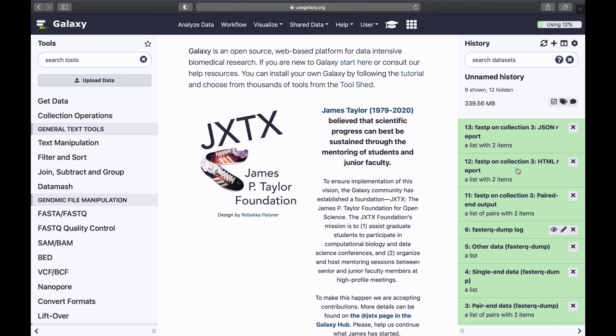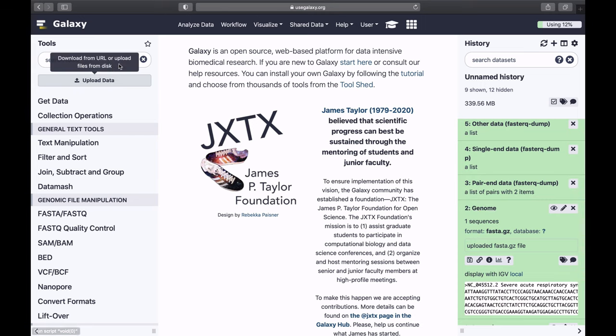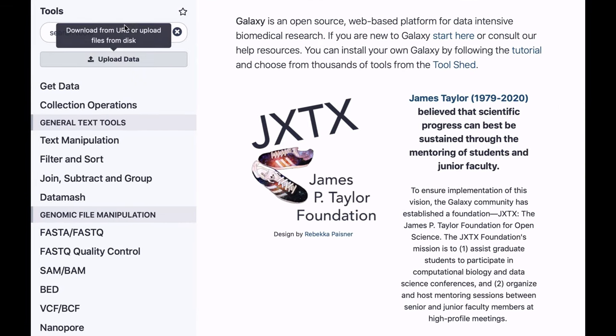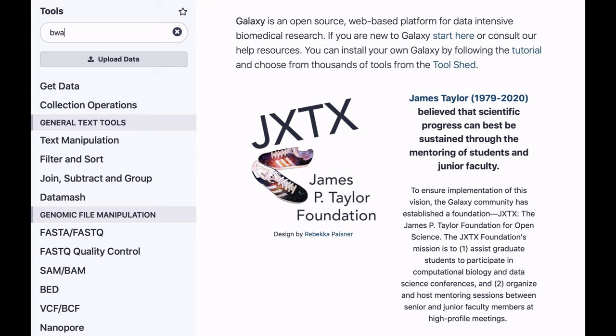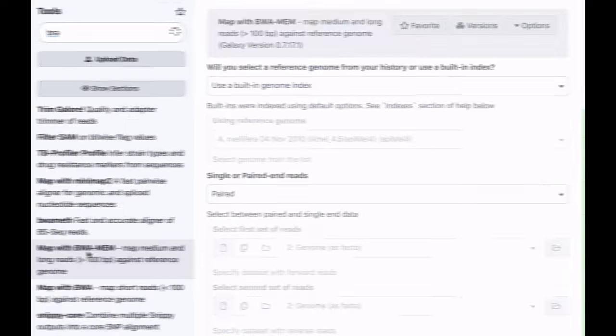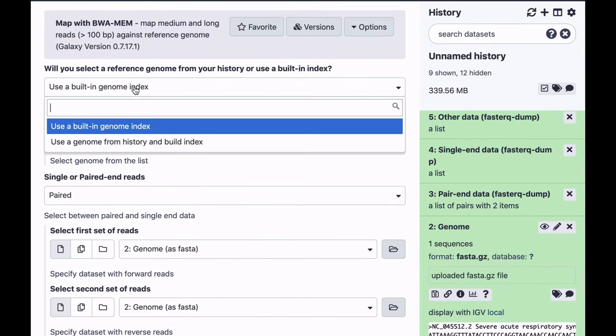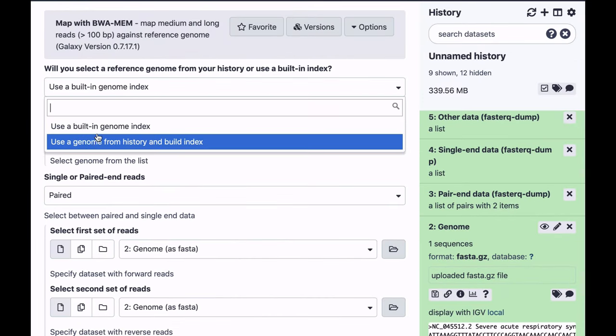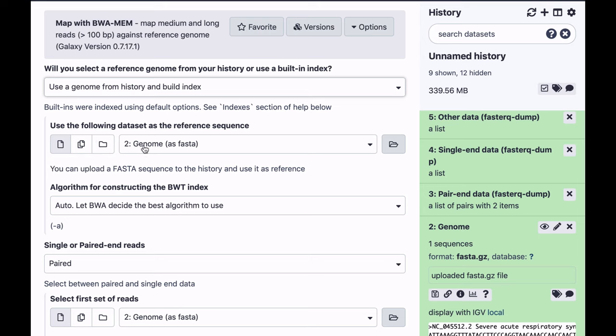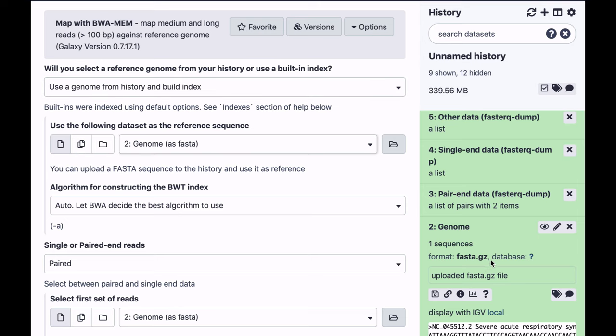Now we can map these reads against the genome. I uploaded the genome into history, it's right here, I'm going to be using BWA-MEM. My genome is now in the history, so I can choose this option. Select the genome, it's right here.